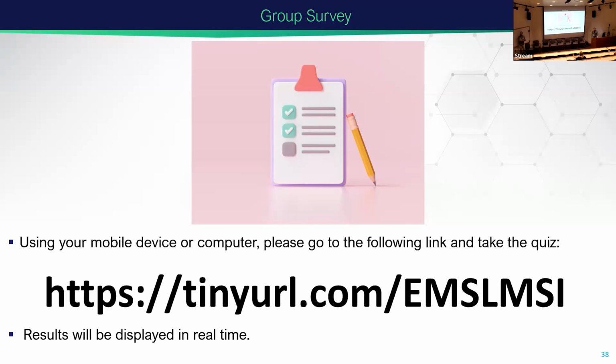And also what I want to say, we use FTICR instruments here that have so many details, and capturing all kinds of transients is so huge. Right. So I guess if you use TOFs or other instruments, data size is much smaller. Yeah. In terms of the SIMS aspect, I don't really use a lot of those, but I mean, think of the FTMS.